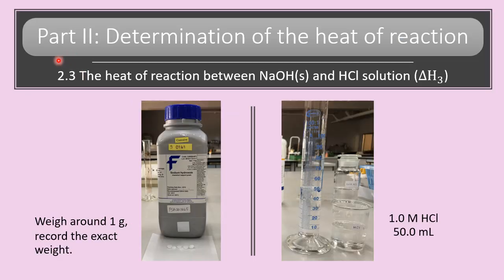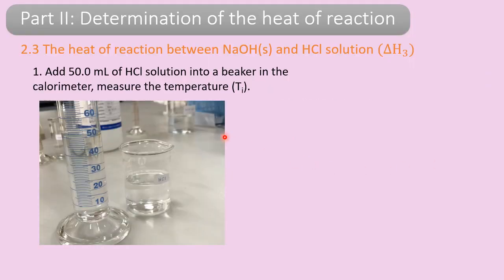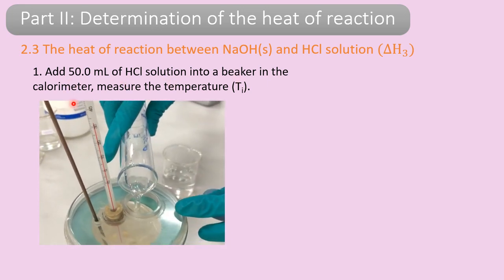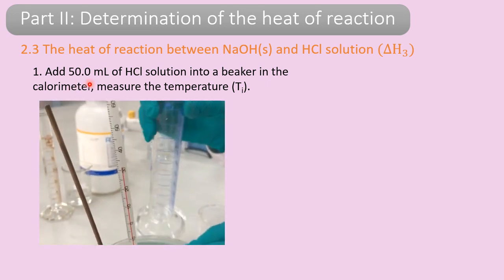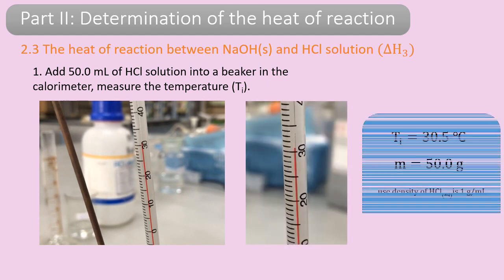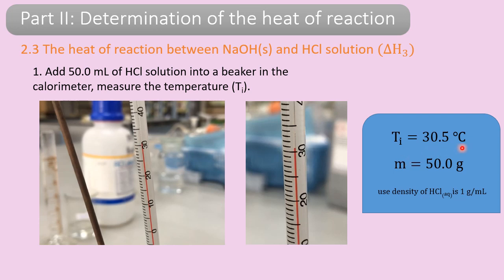Next, move on to part 2.3: the heat of reaction between sodium hydroxide in solid form and hydrochloric acid solution — this is delta H3. Weigh around 1 gram of sodium hydroxide and use 50 ml of hydrochloric acid. Add the hydrochloric acid solution first into the calorimeter and record the initial temperature. The initial temperature is 30.5 degrees Celsius.